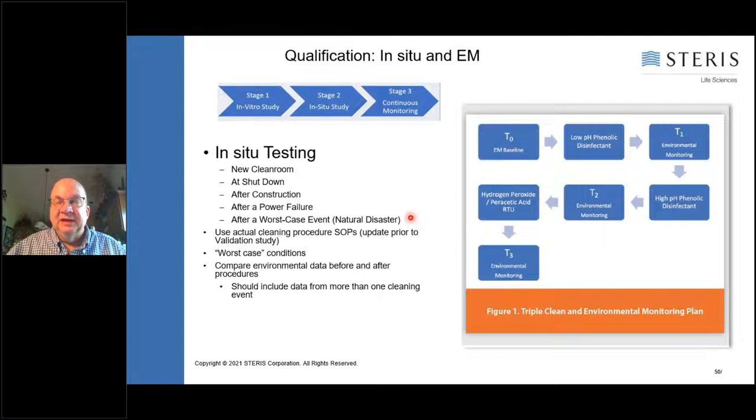I put a poll up yesterday during the PDA New England chapter webinar, and when I got to this topic, I asked the audience how many of them had done this type of testing, this field trial data. And I had about 45% of my audience have done this, and they typically do it after a worst case event, like a power failure or construction event. That's great. That's a good thing.